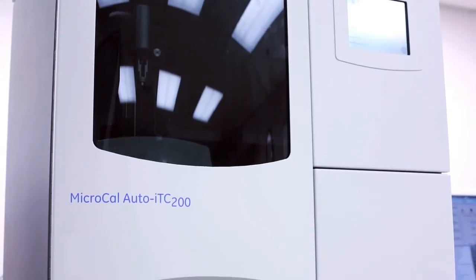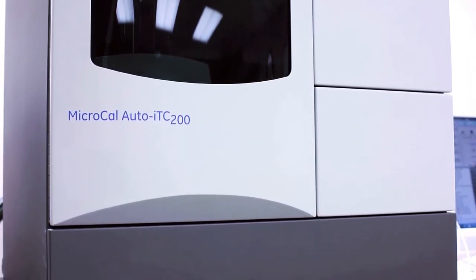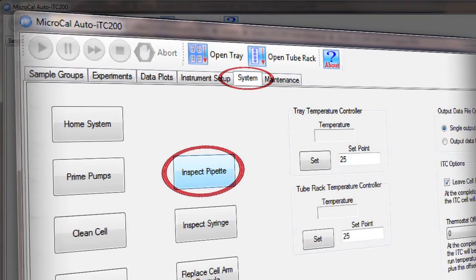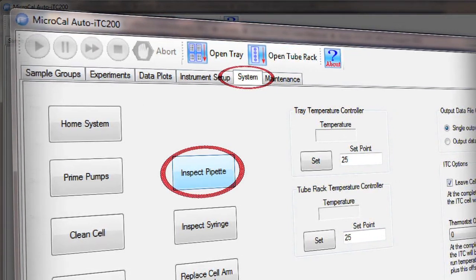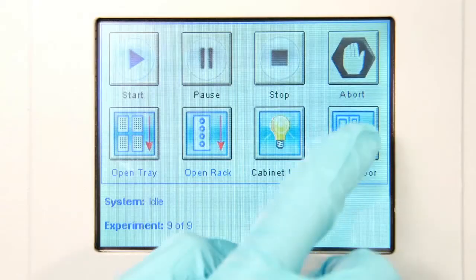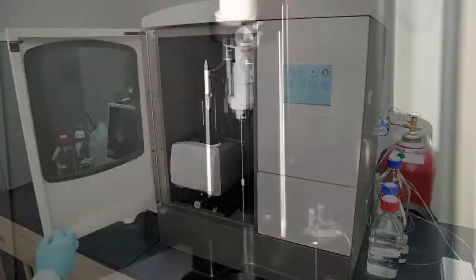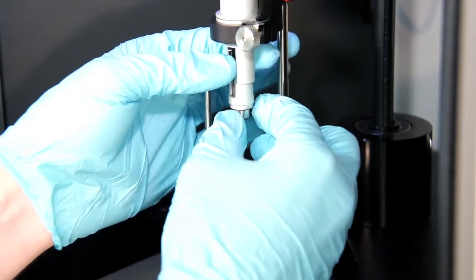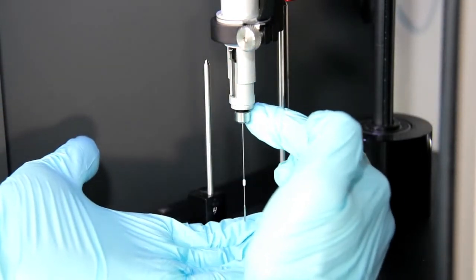To remove a syringe, you need to start with the door closed. Then click the Inspect Pipette button in the system tab of the Auto ITC200 software. This brings the pipette arm around to the front where it's more easily accessible. Now we can open the door. Once the pipette is in position, the first step is to loosen and remove the securing nut, being mindful not to drop it in the cell.